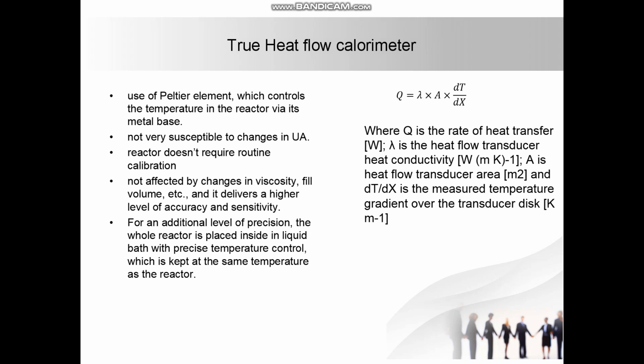In this experiment, a known heater is used to supply heat to the reaction media, and based on the heat input, the exothermicity is calculated. For additional precision, the whole reactor is placed inside a liquid bath to measure the temperature very precisely. The entire setup is kept at the same temperature as the reactor, so there are no heat losses to the surrounding. Thus, it is the ideal way to calculate the heat of reaction.